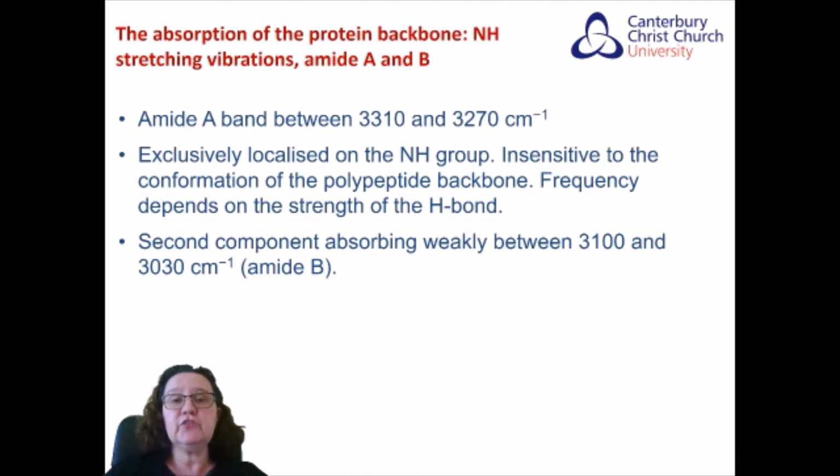The most interesting part of the infrared spectrum of a protein is the bands related to the amide vibrations. And you have quite a few amide modes of different usefulness. We will be focusing almost exclusively on amide 1 and amide 2, but there are quite a few of them. The first ones here in this slide are amide A and B.